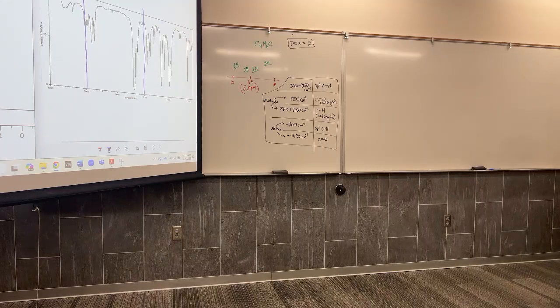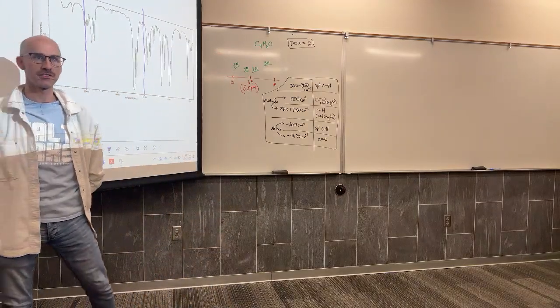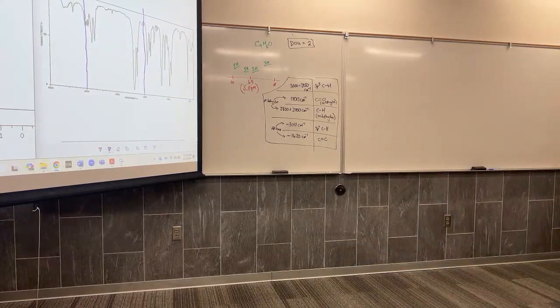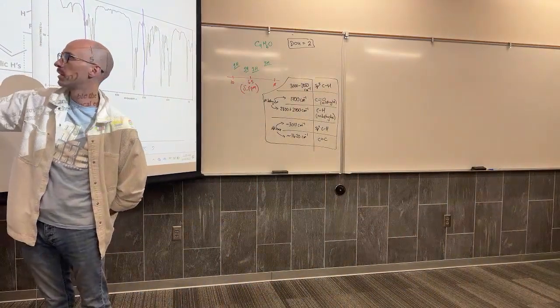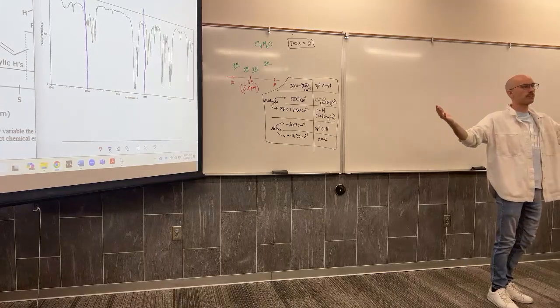Does the NMR help you confirm any functional groups? The NMR helps you confirm the aldehyde? Really? How would it do that? I've got a signal at 9.5, and there are only two types of hydrogens that our correlation table predicts to have signals all the way up that high. Carboxylic acids and aldehydes. And if you remember, the correlation table is laid out so that things more on the right produce signals more to the right, like the aldehyde. Its signal will be closer to the 9 to 10.5 region. Carboxylic acids closer to the 10.5 to 12 region, but could be anywhere in there.